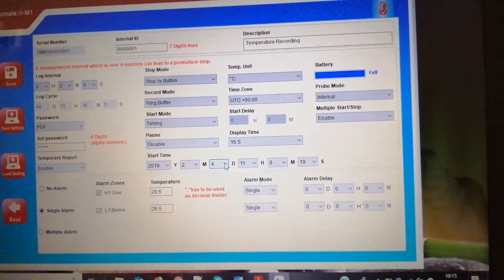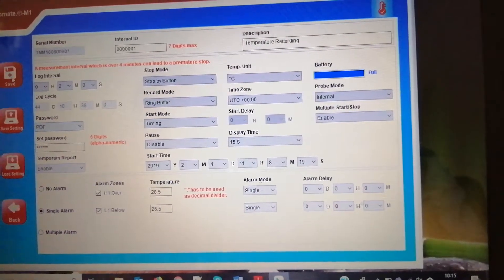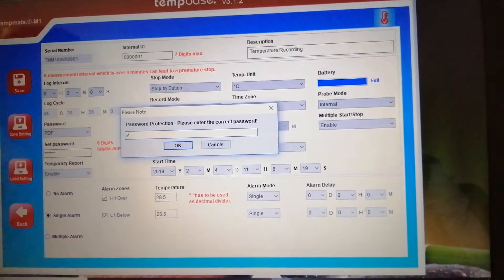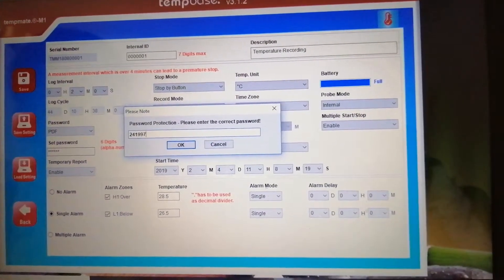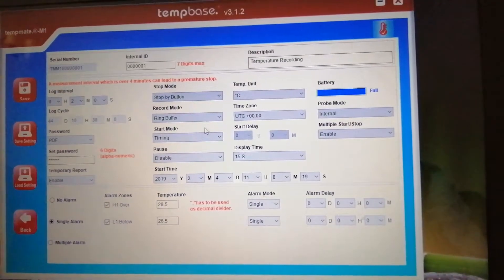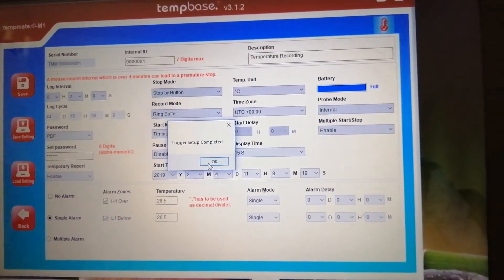I have now set the date to four and saved. Now all the parameters are set and completed.